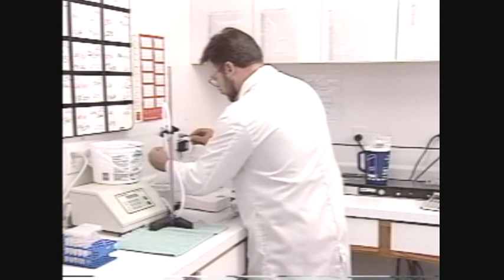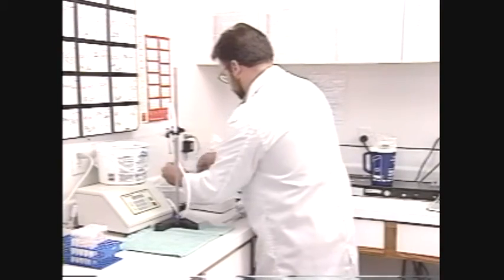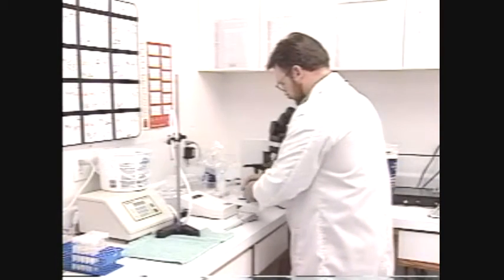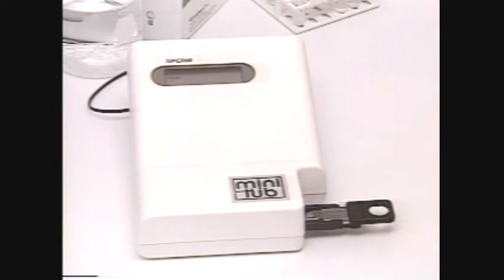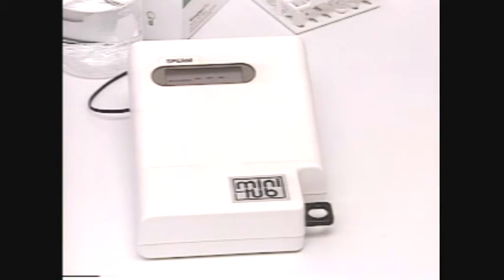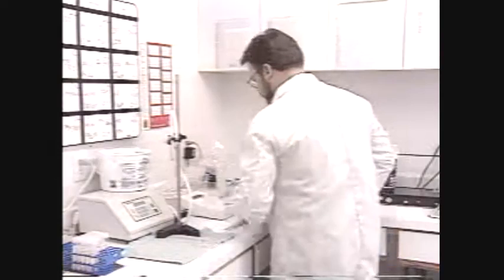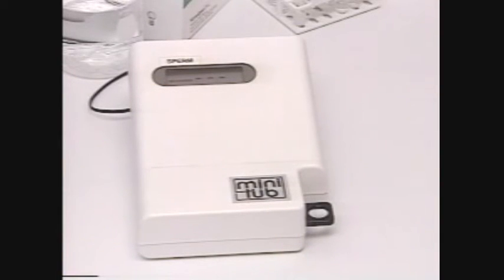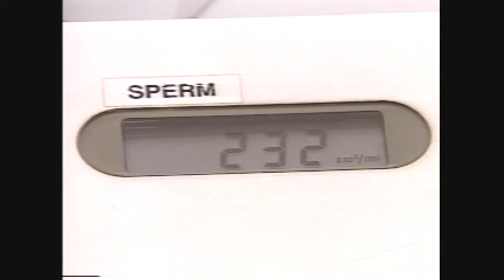In the case of ejaculates, the photometer is typically calibrated using another counting system, such as a hemocytometer, and a calibration curve is established, which equates different sperm cell concentrations with equivalent transmittance or absorbance values. Hundreds of ejaculates of different concentrations are used to perform the calibration. Unlike most photometers, the SpermaQ directly provides an output reading in sperm cells per milliliter.